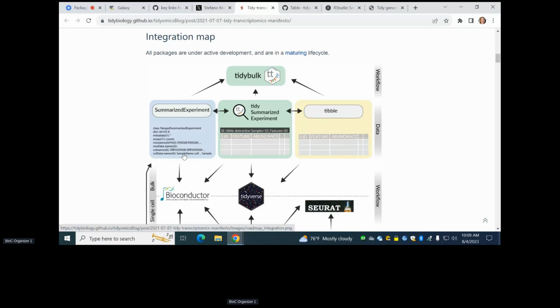Yeah. I had problems before switching between the different versions of Seurat and the SingleCellExperiment and back to specific analysis, like the time with Monaco. Do you have a way to get past that? At some level, in the sense that these two tidy adapters do not do analysis. So you do analysis the way you did, but the data manipulation, yes.